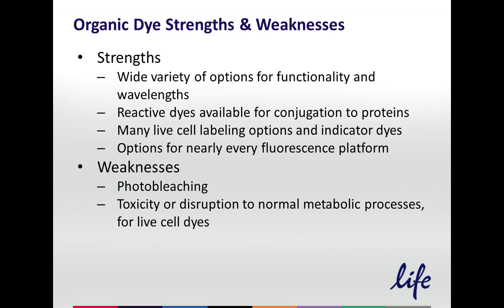Another issue for live cell stains is that many live cell dyes are toxic to cells over time. So if you leave it on too long, you might start to see blebbing or other toxicity-related issues with your cells. So those are some weaknesses.